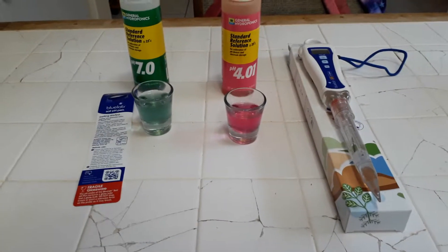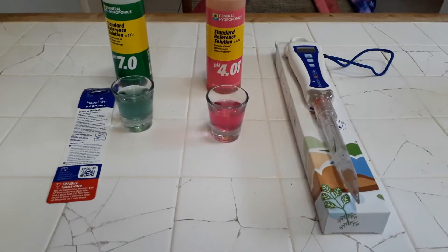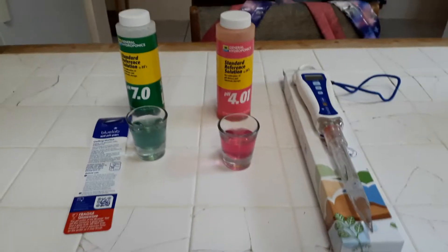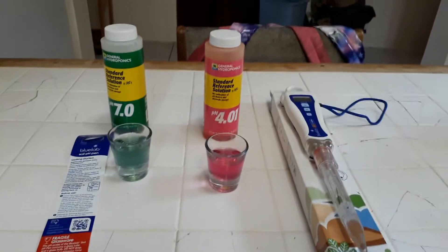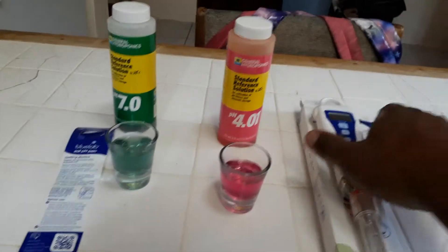Hey growers, so I finally got my Blue Labs pH soil meter and I'm about to do a quick calibration video before I test it out. I have my 7.0 calibration solution, my 4.0 solution, and my Blue Labs pH meter. It's pretty large — I thought it would come a lot smaller.